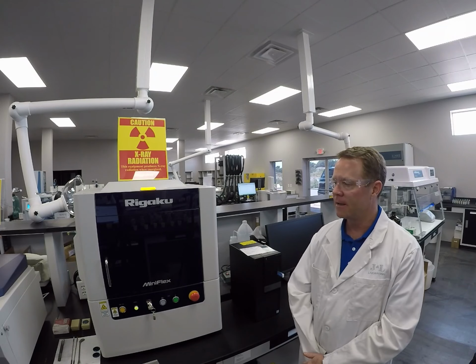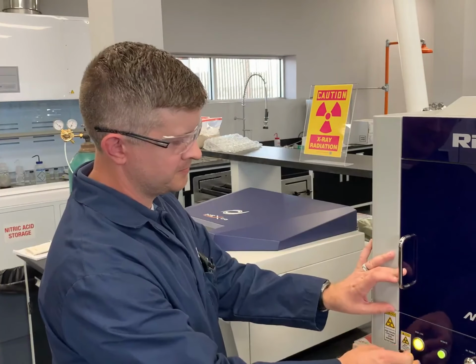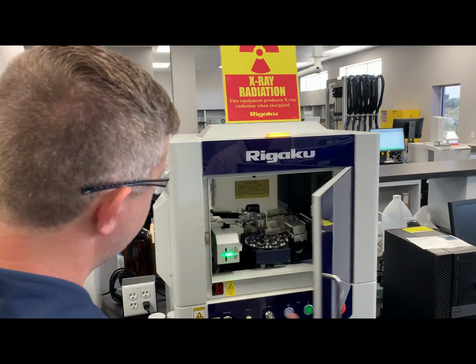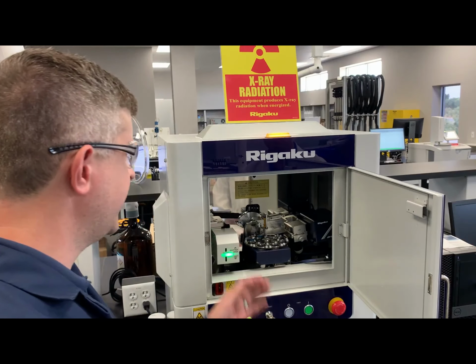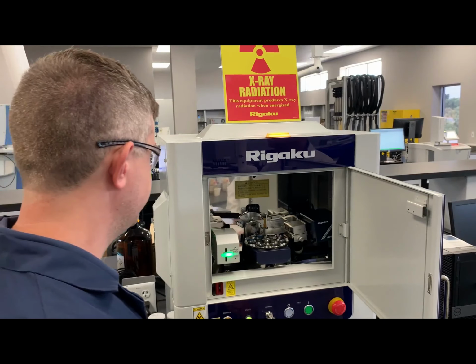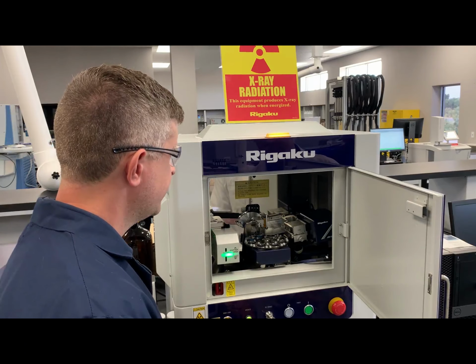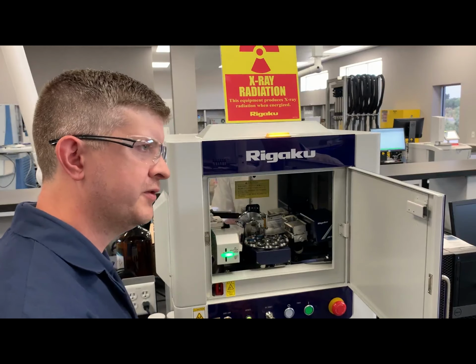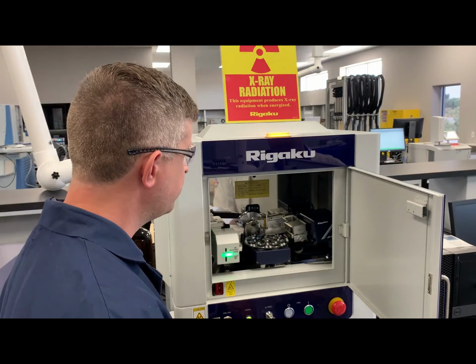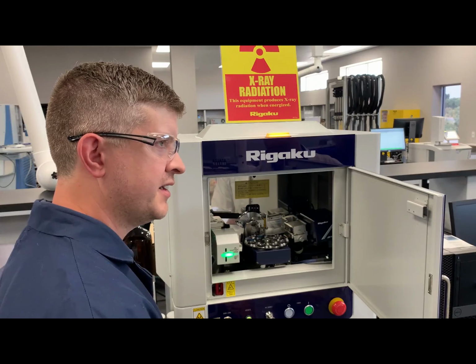Eric, why don't you show us inside the guts of one of these instruments? Sure, no problem. So this is the inside of the XRD. It has an 8-position carousel, so we can load up our sample tray and load up 8 solid samples. Tell it to go. Every 11 minutes it's going to finish a sample. So it's a very robust solids technique.